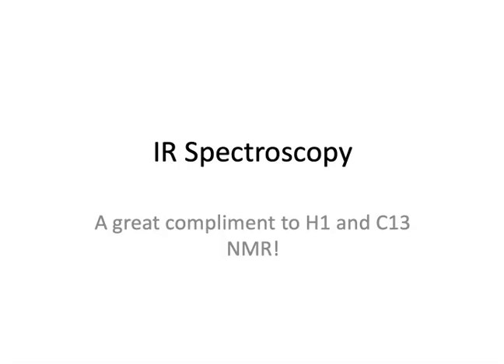It's time for more melodious droning about a random bit of spectroscopy that's going to be important in organic chemistry. And this is IR spectroscopy. This has to do with molecules absorbing energy in the infrared part of the electromagnetic spectrum.